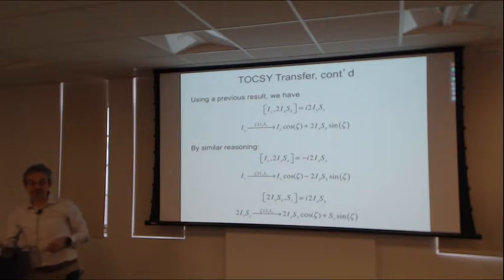So there were initial papers about doing this, but practical application required invention of ways of averaging out the chemical shift interaction with minimal power, and it would be broadband, because, of course, if we just turn down the RF power, the first thing that happens is we have very strong resonance offset effects, so that a 180-degree pulse on the alphas is no longer a 180-degree pulse on the NHs.